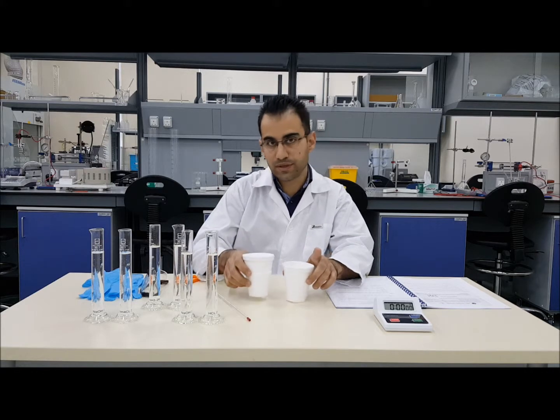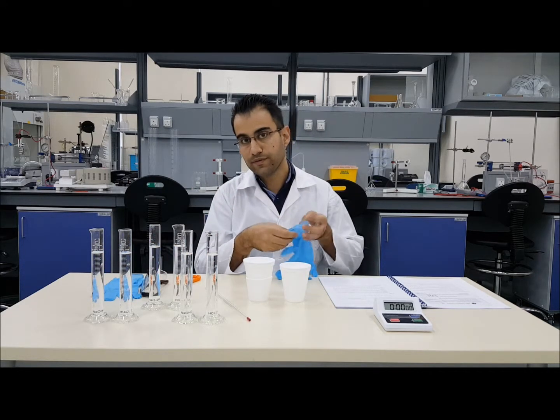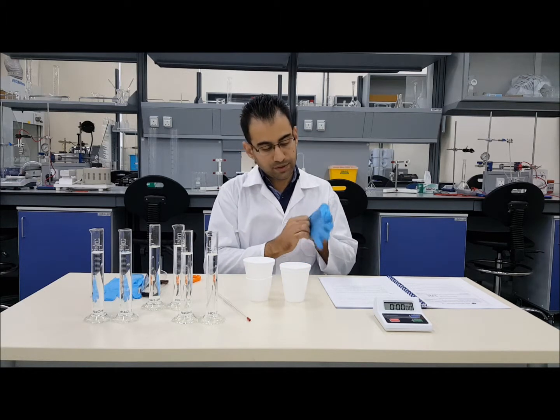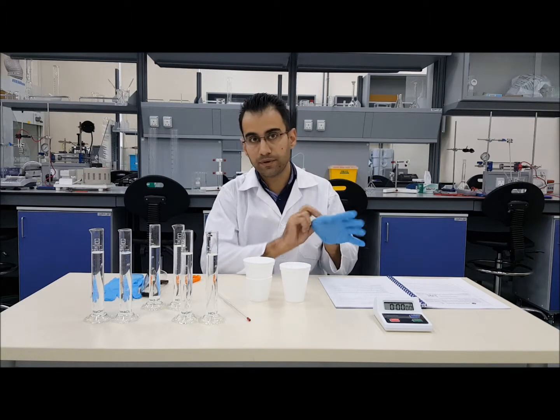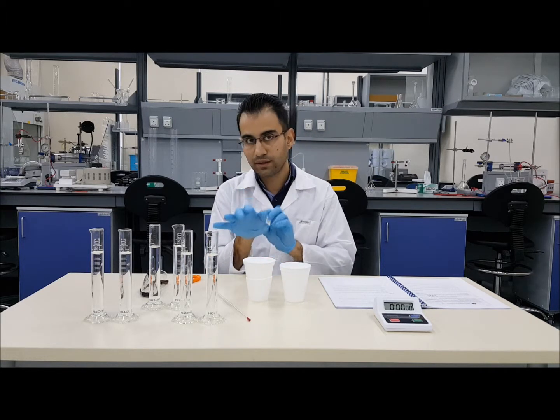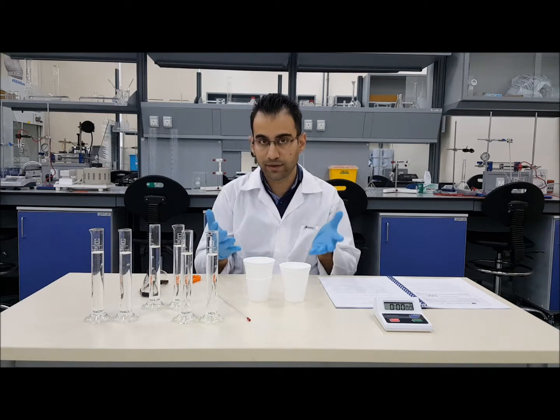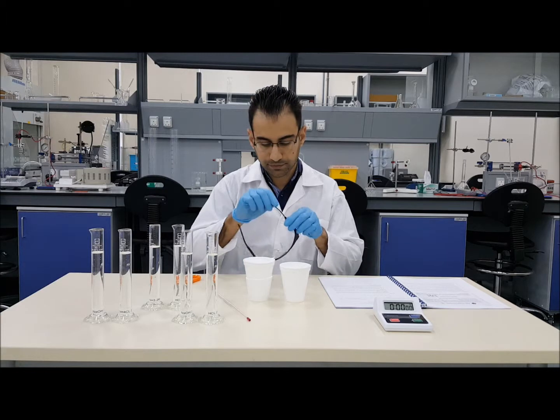Before starting with this experiment, you need to make sure that you are wearing your gloves and safety goggles all the time. You are dealing with dangerous chemicals which can cause chemical burns, and they are toxic. Always keep your gloves on and avoid using your personal equipment while wearing the gloves or contaminated gloves.